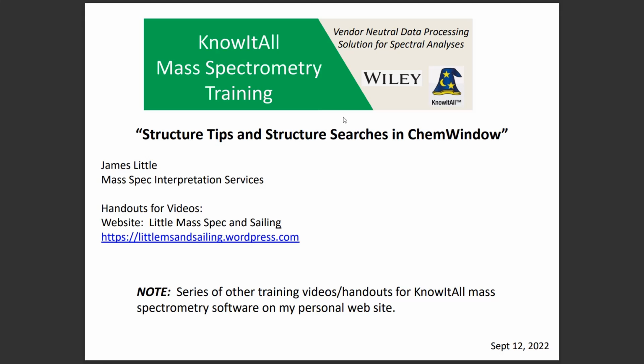Wiley has introduced new Mass Spec capabilities in their KnowItAll software. KnowItAll is a vendor-neutral data processing solution for spectral analyses. I have created a series of training videos for the software which can be found on my personal website. Today I will be sharing a presentation entitled Structure Tips and Structure Searches in ChemWindow.